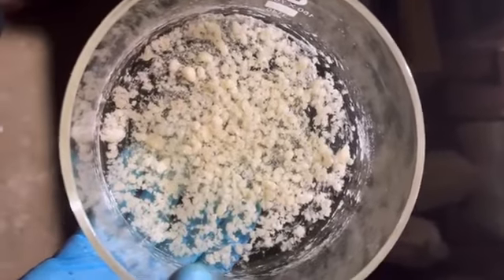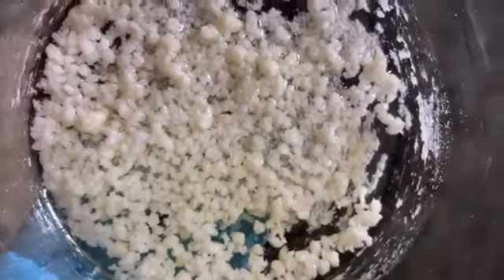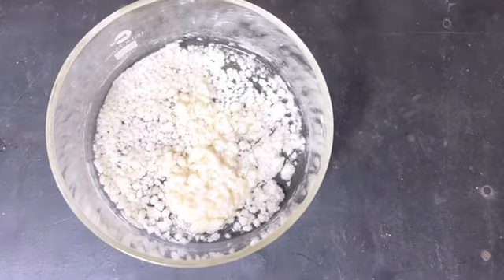The mixture on cooling down solidifies as a white fluffy precipitate and this is a much purer product. Since I wanted the crystalline product, I decided to crystallize it again. I filtered and dried the fluffy product and then added water and charcoal and boiled it for another 15 minutes, and then it was filtered hot just like the previous step.